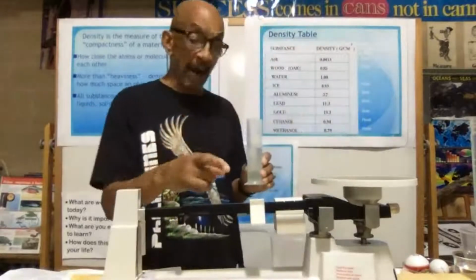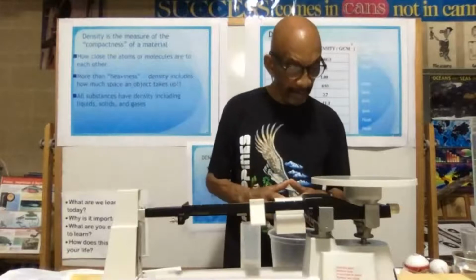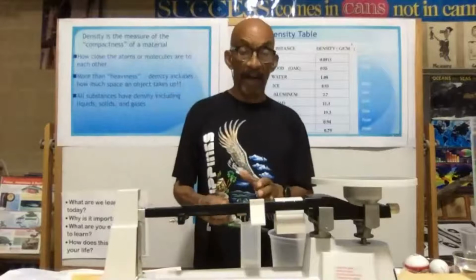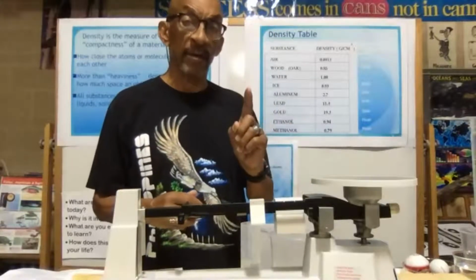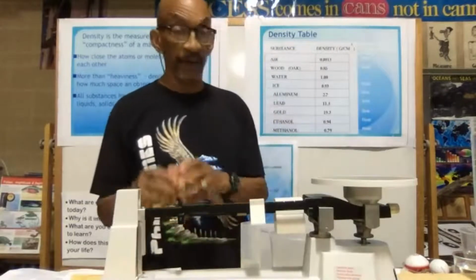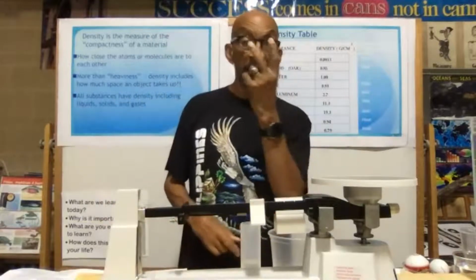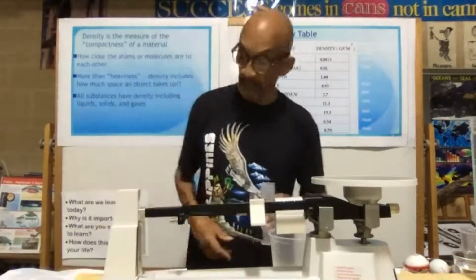Now, I did have a chance to weigh this marble. And this marble, guess what it weighed? It weighed 20 grams. So I'm going to divide, in fact, I'll share this with you. 1 milliliter is equivalent to 1 centimeter cubed. So actually, I'm going to be using 10 centimeters cubed, and I'm going to divide it into the mass, which was 20 grams. So my density is going to be 2. Now, you know what that tells me?